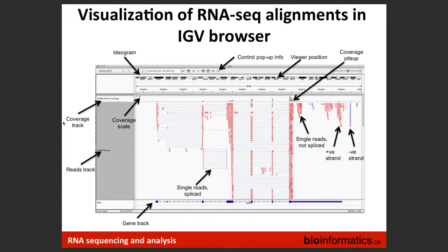This is what IGV looks like. At the top you see chromosomes with p and q arms. Each line represents a single read. At the bottom is the transcript annotation — exons and intronic regions. The idea is to compare your read coverage distribution to the known transcript assembly. Ideally you don't want reads piling up on intronic regions. What you want is reads piling up where exons are in the annotation file.